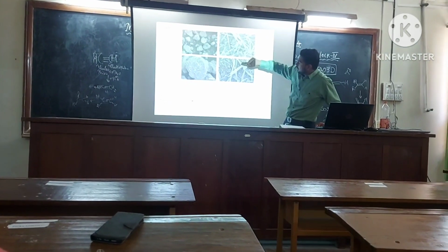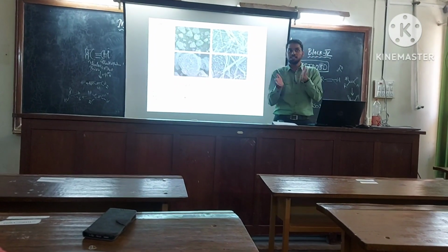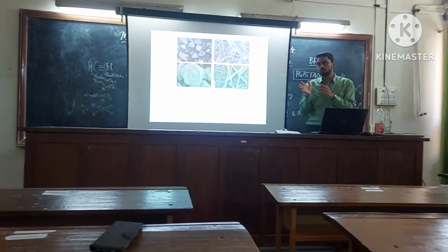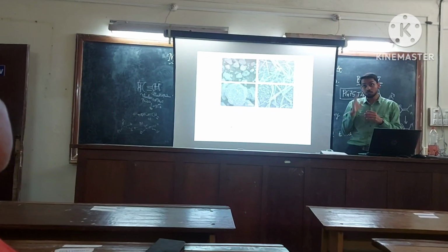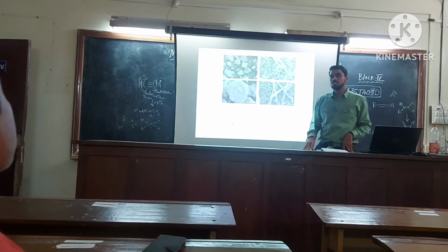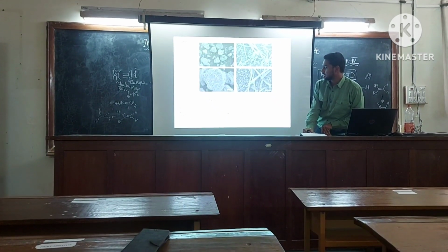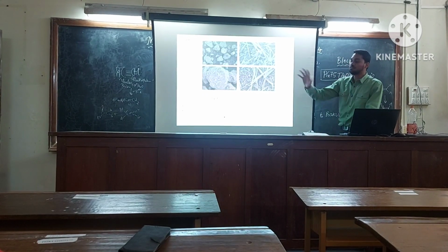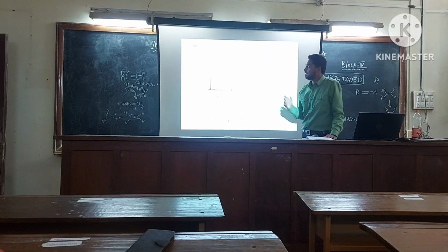Whenever we take copper sulfate as the initial agent, during the literature survey we saw that most of the copper sulfate were giving copper oxide nanoparticles in a spherical form. But here, to our surprise, we found that our copper oxide nanoparticles were in needle shape. This was quite surprising for us, so that is what we have reported here. Interestingly, the shape of the copper oxide nanoparticles was in needle form, a bit different from the trend that was going on. Coming to EDX, it is the energy dispersive X-ray spectrum.